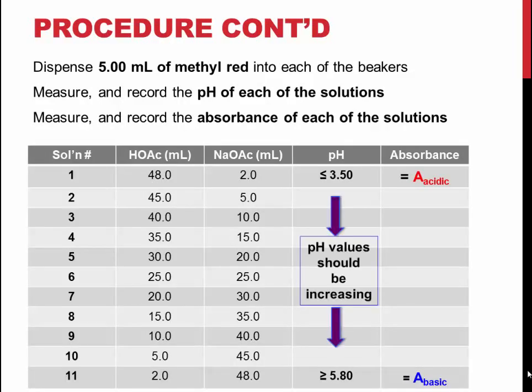Add 5 ml of methyl red solution to each of the buffer solutions you prepared, and mix thoroughly.